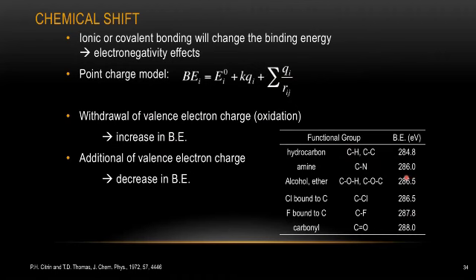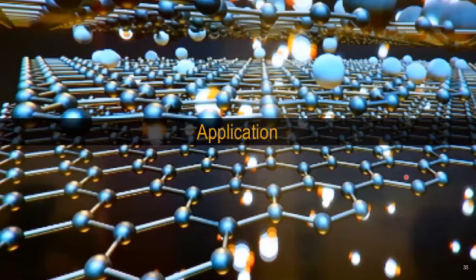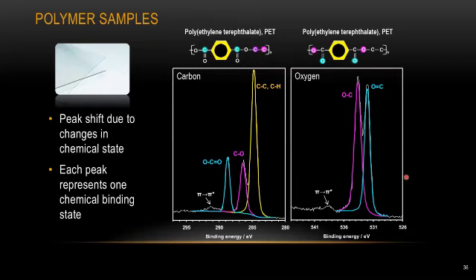And that's all about the data I want to describe today. So let's start looking at some applications you can use for XPS measurement. Even though the first main type of data you're going to receive from the XPS system is the elemental information, if your data has high enough resolution and you can get a nice peak fitting, you can get some molecular information. So the data on the screen are just the high resolution scans for the carbon 1s and also the oxygen 1s.